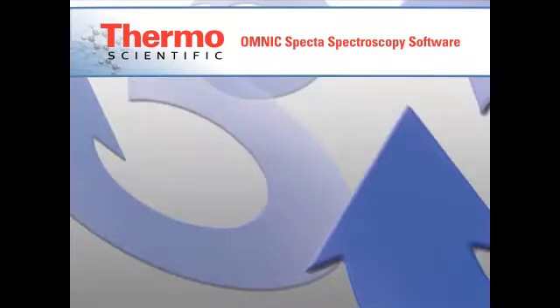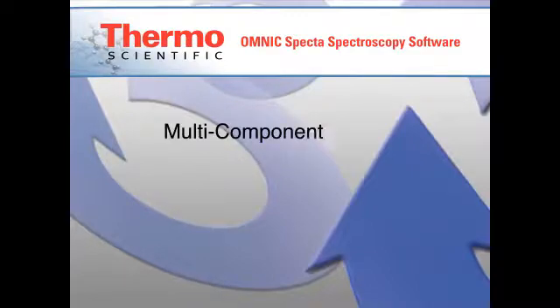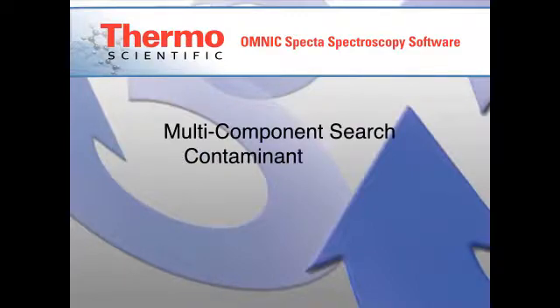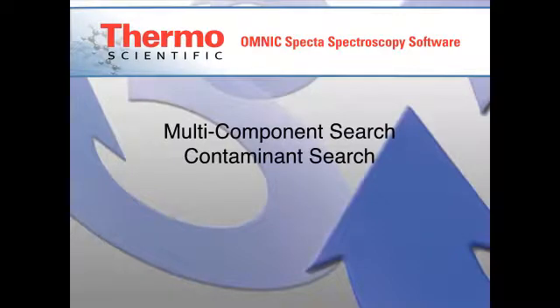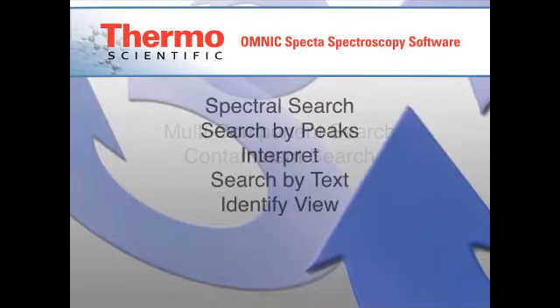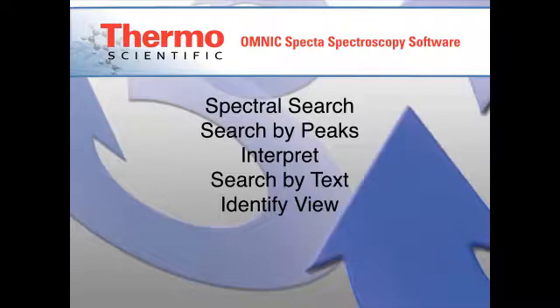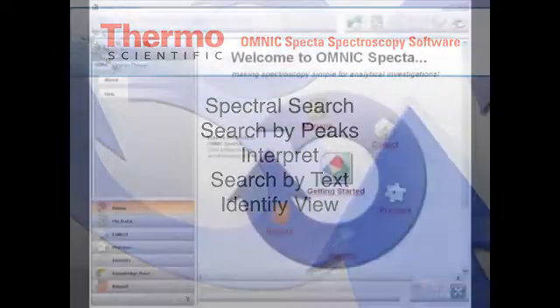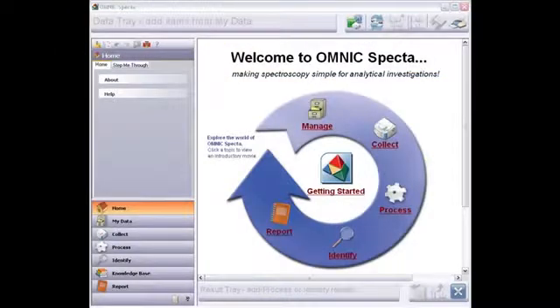SPECTA offers two approaches to mixture analysis: multicomponent search and contaminant search. Information about SPECTA's other search techniques and general features of the Identify view are provided in other videos. This video focuses on tools for searching mixtures.